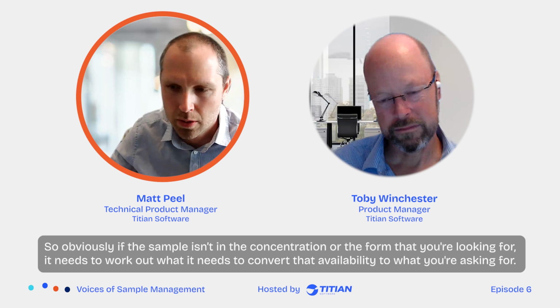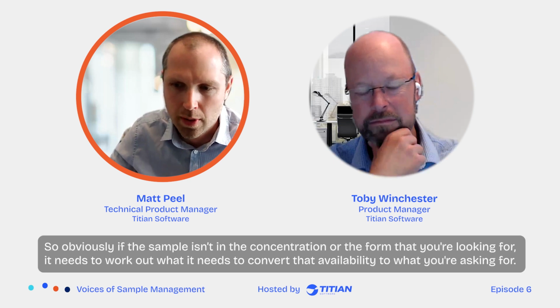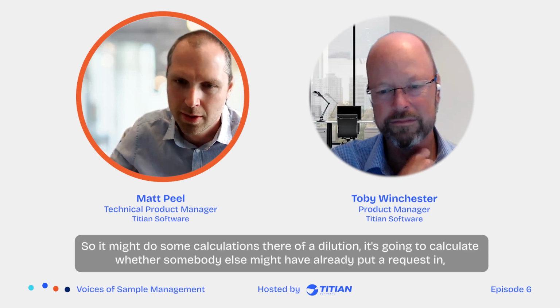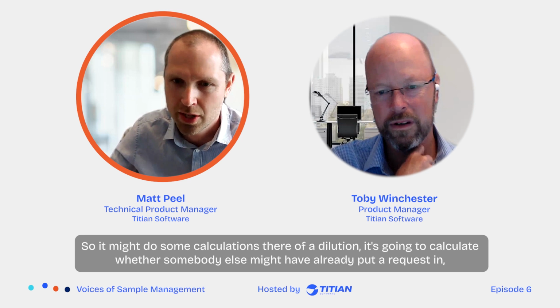So it needs to see what's available. Obviously if the sample isn't in the concentration or the form that you're looking for, it needs to work out what it needs to convert that availability to what you're actually looking for. So it might do some calculations there of a dilution.